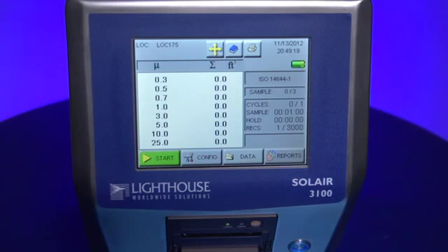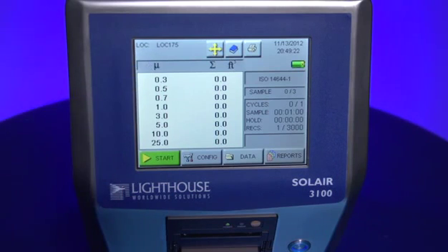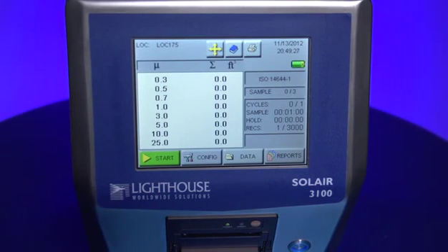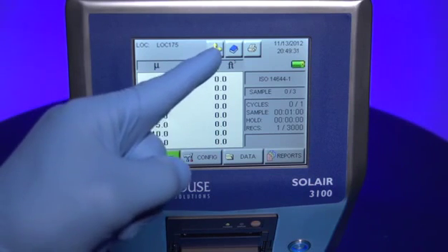The current location is displayed in the upper left of the main display. New locations can be selected by touching the Location button at the top of the display. The Location button is a button with the yellow arrows pointing up, down, left and right.